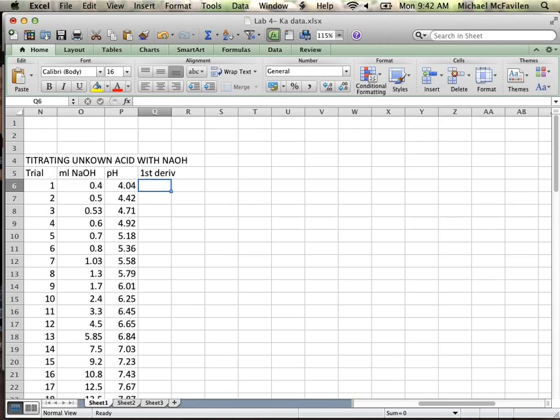Okay, so our y value, or our slope, is the change in y. Which was our change in y? The volume or the pH? The pH. So what we'll go through and do is we'll look at the difference in our pH across those two data points. We then want to divide by, what is it? Rise over run, our change in x. What's our change in x?